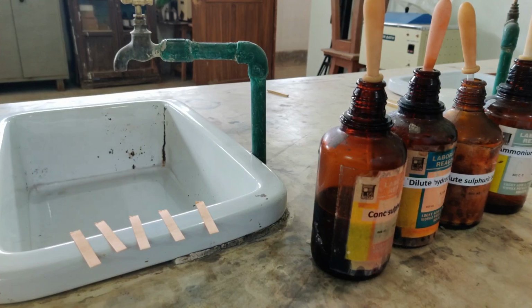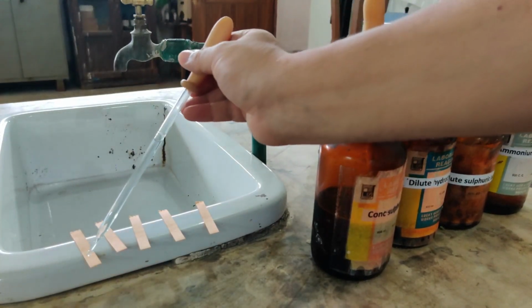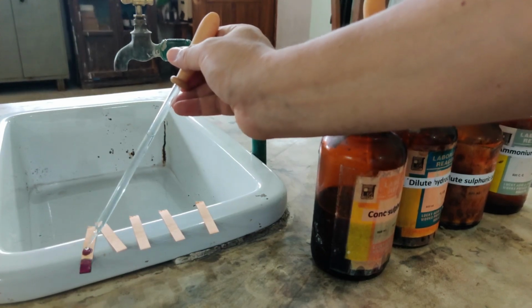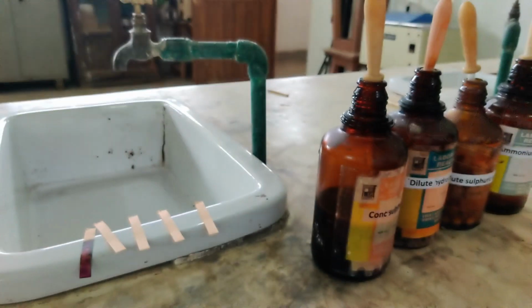So I am first starting with sodium hydroxide. Let's see what happens when I am using sodium hydroxide solution. Okay, here just let me use a few drops only. Here it is. So the first universal indicator paper I have used sodium hydroxide.